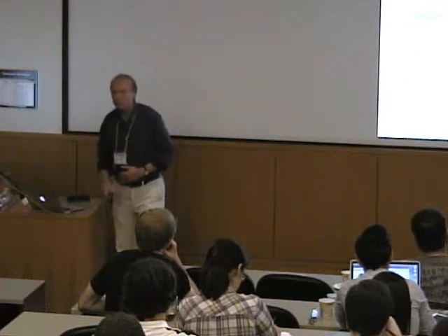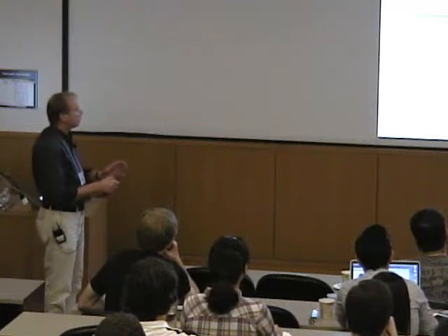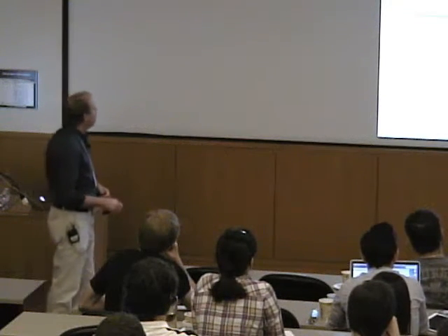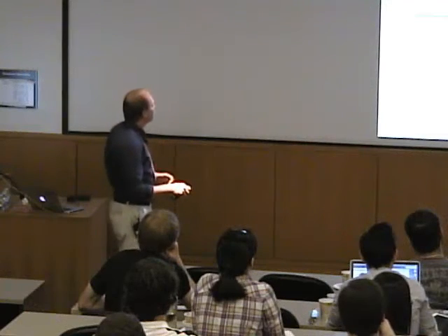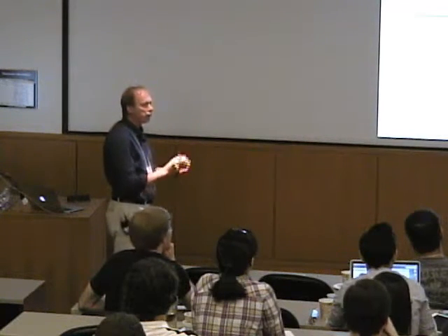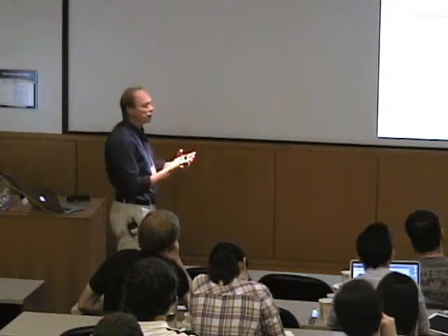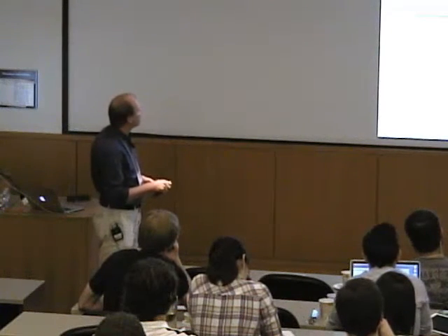All right, so what we do when we start an EPR experiment is, on the console and the electronics that control the instrument, we can put it into a mode where we sweep the microwave frequency through some narrow range, where we can see the amount of power which is being reflected back out of the resonator. And at the resonance frequency of the resonator, the power gets absorbed. Right?